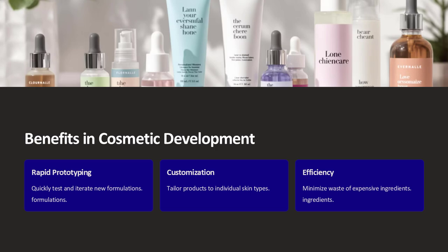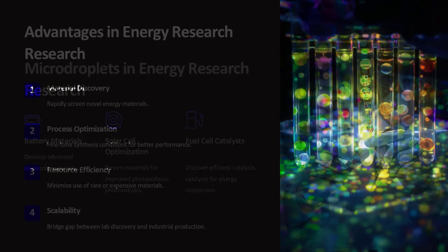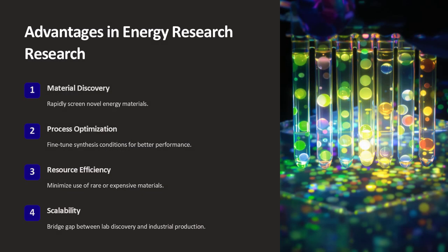A common question that arises is, what are the limitations of using microdroplet libraries in combinatorial chemistry? While the advantages are numerous, challenges remain. One major challenge is ensuring the stability and uniformity of droplets over extended periods, especially when reactions require longer incubation times. Droplet coalescence or evaporation can affect reaction outcomes, so researchers must optimize surfactant formulations and device designs to maintain droplet integrity. Additionally, integrating multiple steps of a reaction within the confined space of a droplet requires precise control and synchronization, which can be technologically demanding.